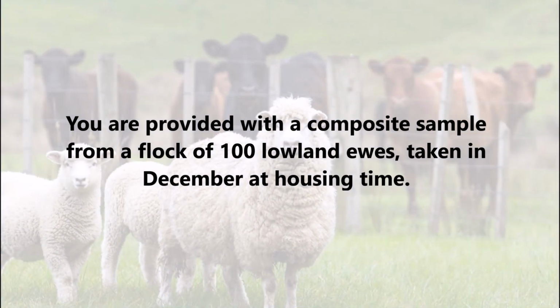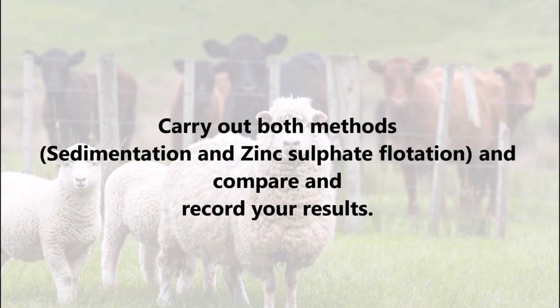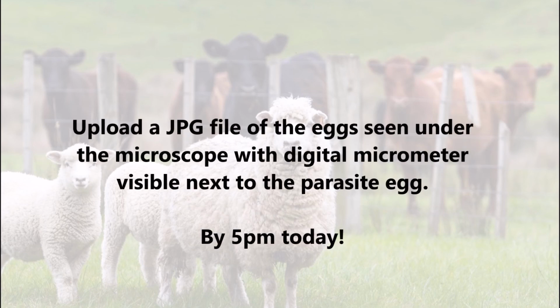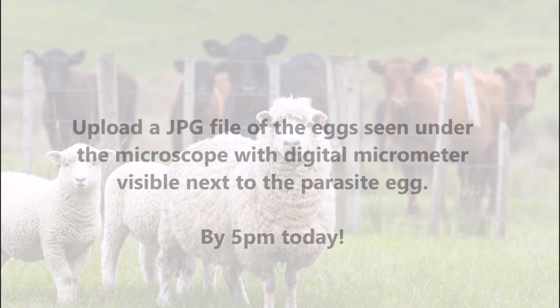You are provided with a composite sample from a flock of 100 lowland ewes taken in December at housing time. Carry out both methods, sedimentation and zinc sulphate flotation, and compare and record your results. Upload a JPEG file of the egg seen under the microscope with digital micrometer visible next to the parasite egg. You have until 5 p.m. today.